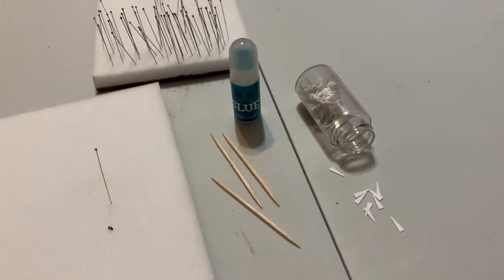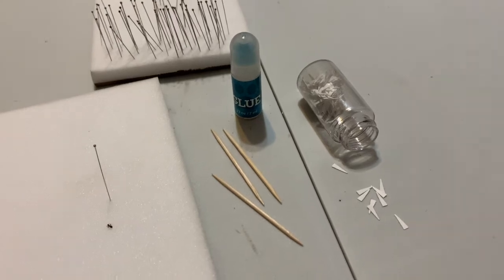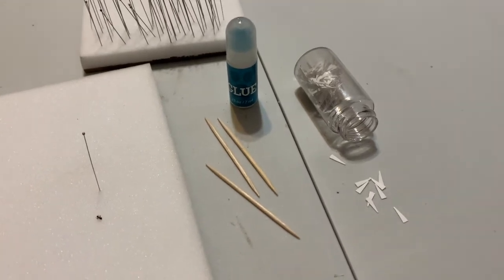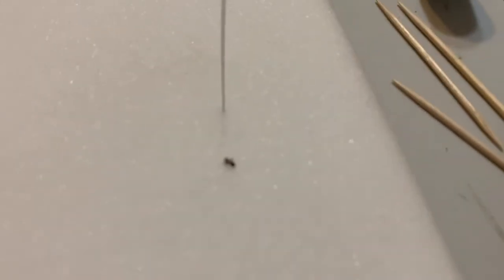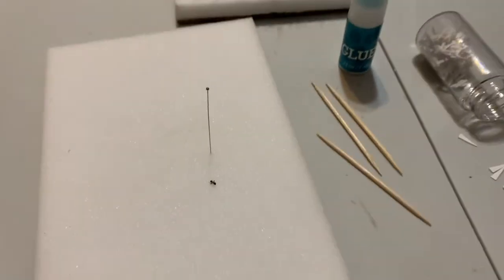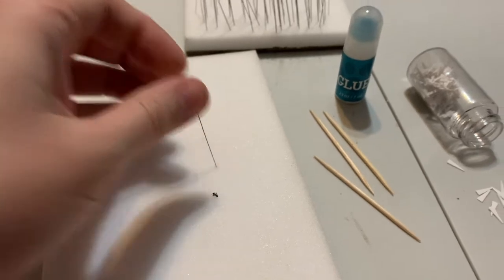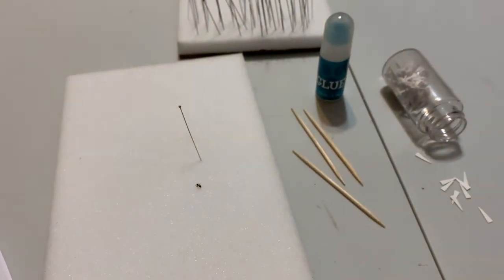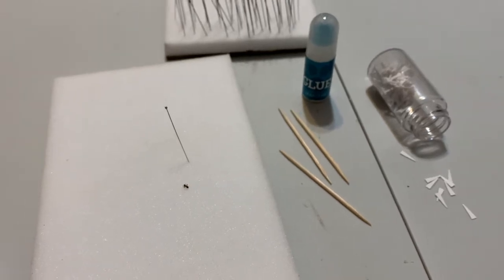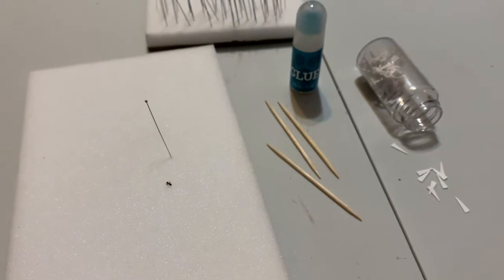First of all, what do we use pointing for? Pointing is used when you have an insect that is too tiny for a pin. My specimen today, if we can even see him, is a tiny little ant. You can see this is actually quite a small pin, but the pin is still much too large for this ant.